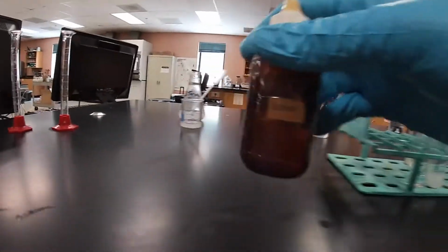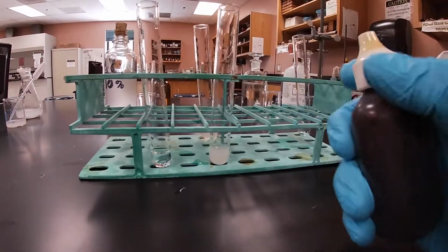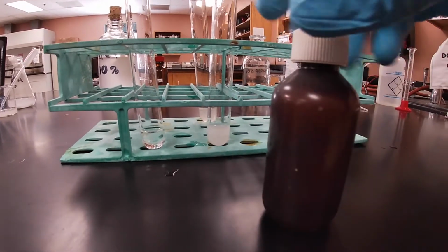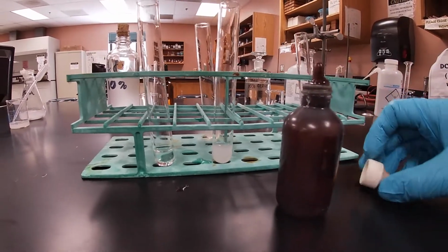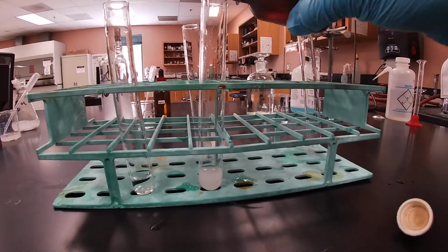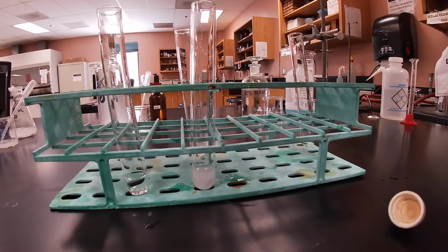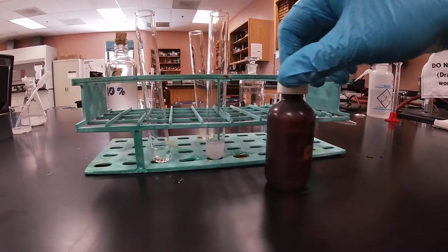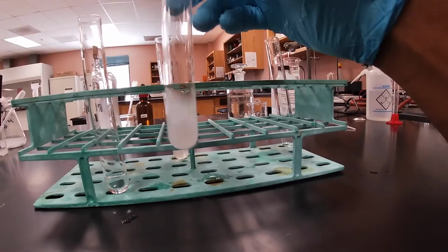So now what I'm going to do is add some iodine. Let's go ahead and move it a little bit to the side. I'm going to add some iodine. And you got to be careful with iodine. Definitely toxic. And so we're going to add 2 to 3 drops, and then we're going to determine a change. 1, 2, and 3. So now let's go ahead and close it. And now we're going to go ahead and stir.